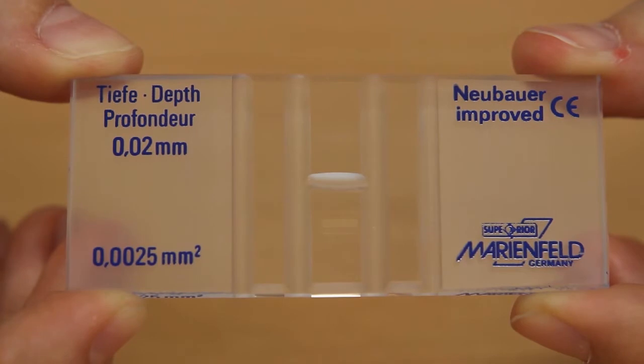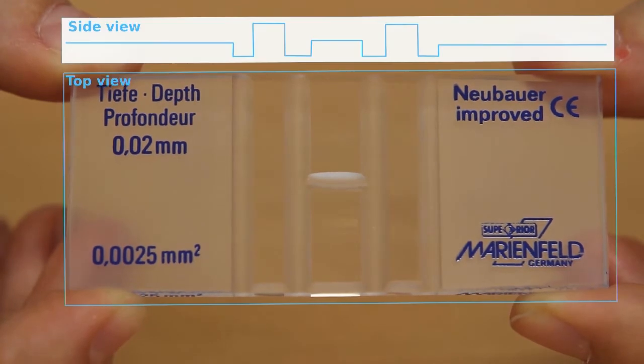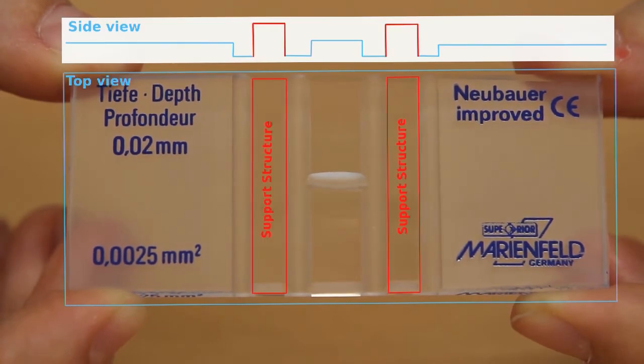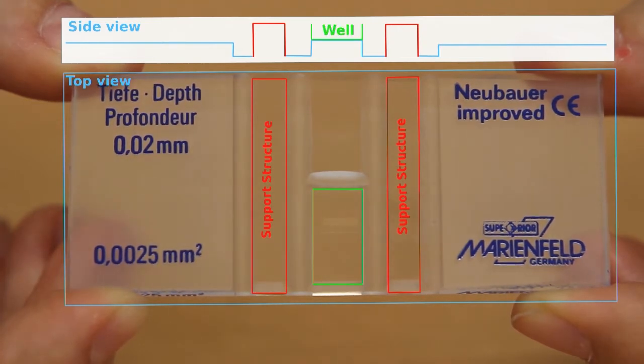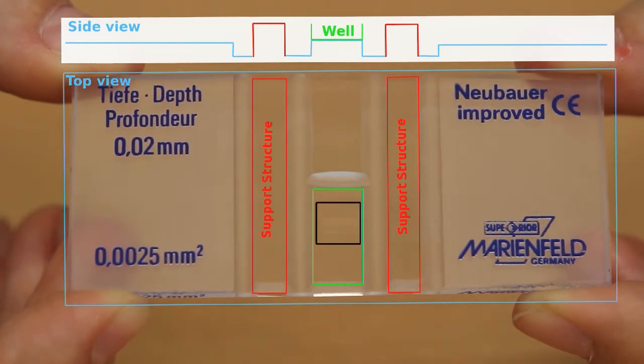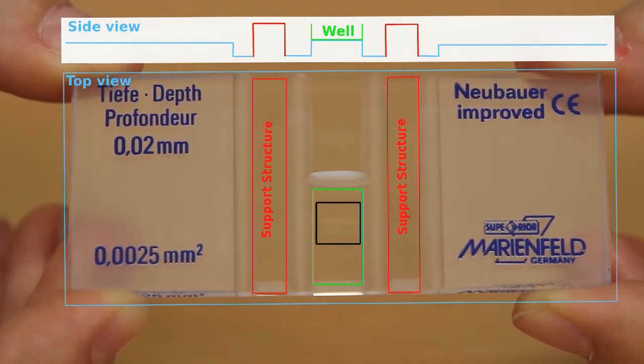A hemocytometer consists of a thick glass microscopy slide with two support structures in the middle. The area between those structures creates a well with a defined area. Additionally, lines are etched into the surface which further subdivide the area.